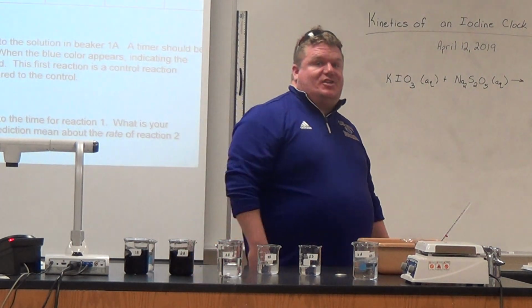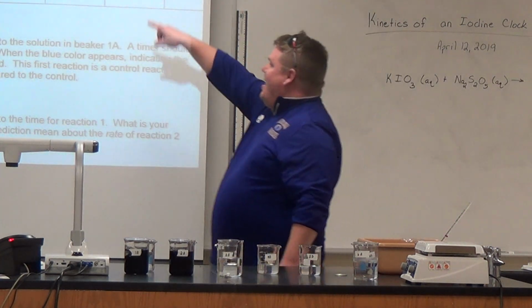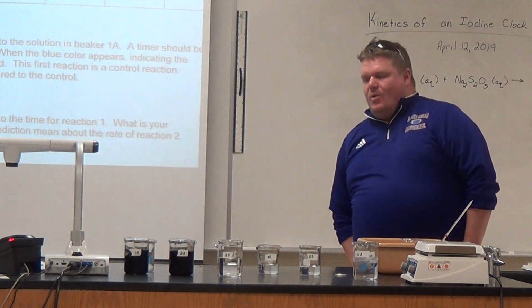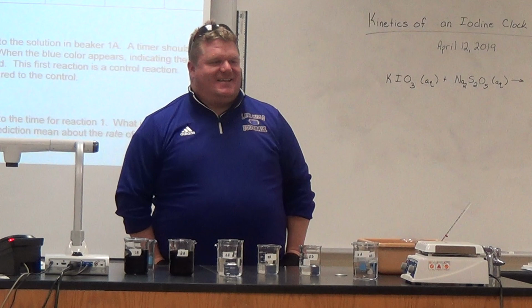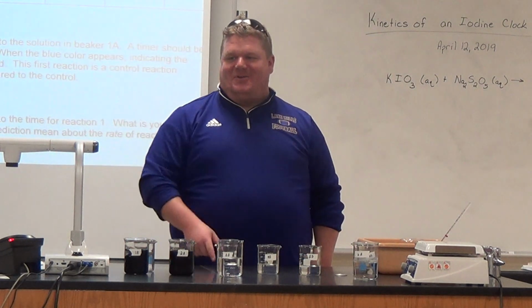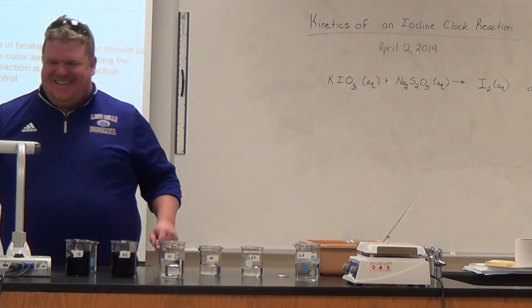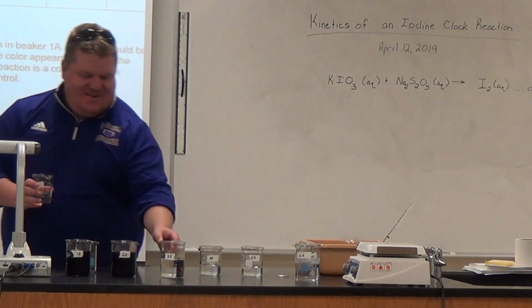So now make a prediction for the next one. Okay, again, look at the reaction contents there. Again, compare it to reaction number 1. What do you think is going to happen? Well, is it going to be faster or slower? Elizabeth, what do you think? Slower, because there's less of the gas. So she won the first battle. You're going to challenge her on this? No. Yeah, sure. All right. Let's try it out here.